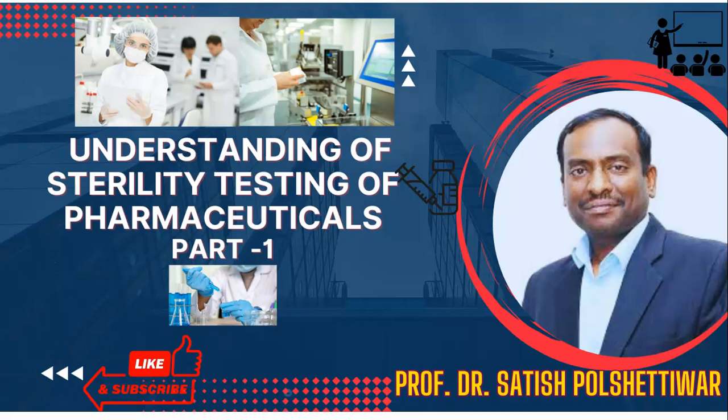Today, we are diving into a vital quality control test, that is sterility testing. Let's discuss and understand the sterility testing of pharmaceuticals, part 1. So sterility testing, why it is important, how it is done, let's explore.